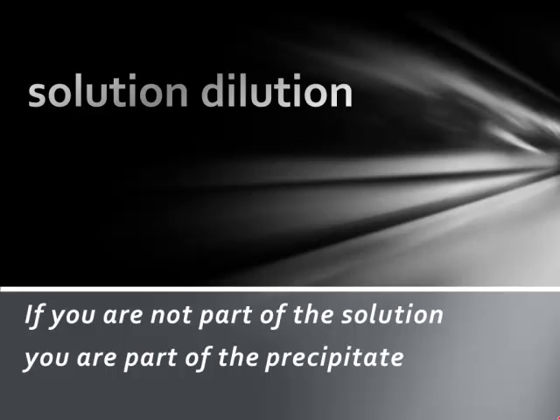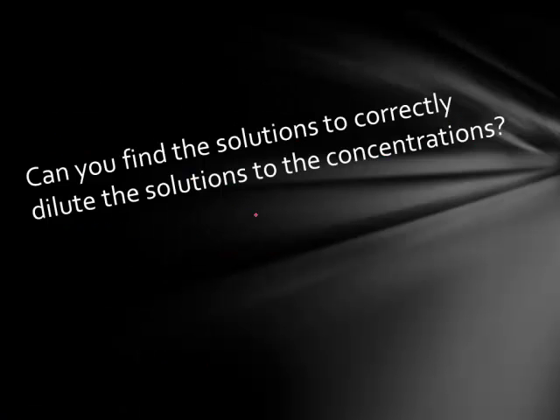Time to get ready for another lab, and so you're going to want to take some notes and pay some special attention to this video as we think about making some dilutions of some solutions. Here is the question you are going to answer in this lab. Can you find the solutions to correctly dilute the solutions to the concentrations that we're asking for? That's what your task is going to be.